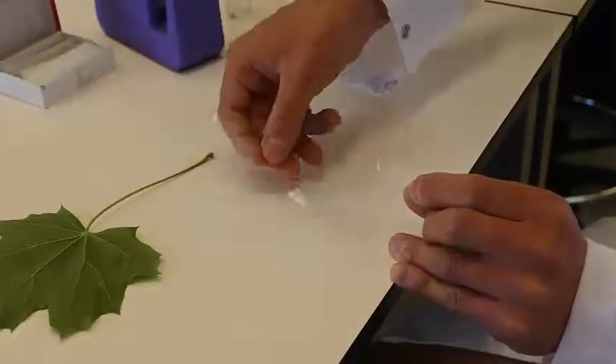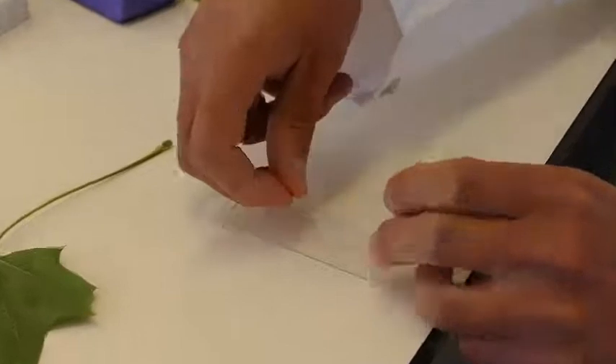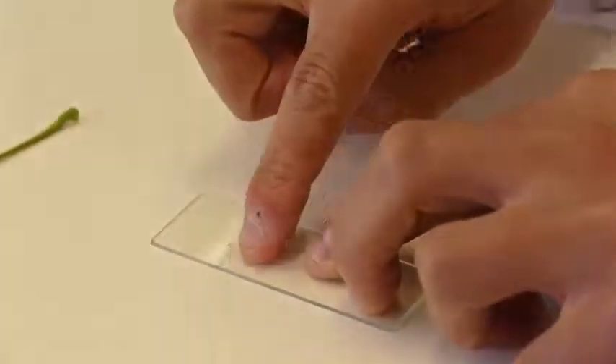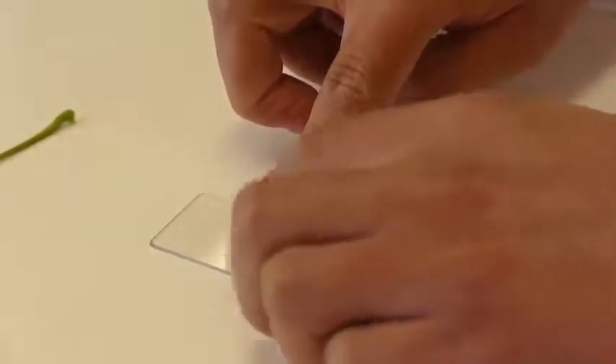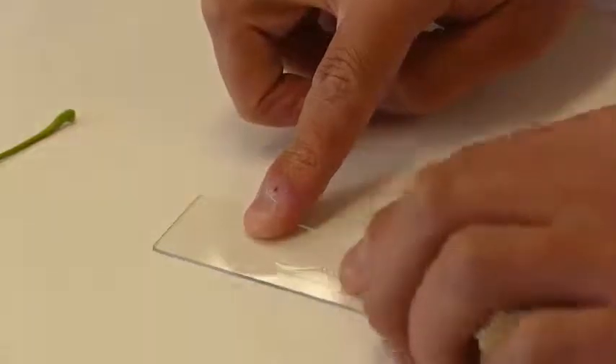Take a glass slide and place the nail polish and sticky tape onto the slide. Gently press down, again trying to avoid air bubbles, because that makes it harder to see through the microscope.